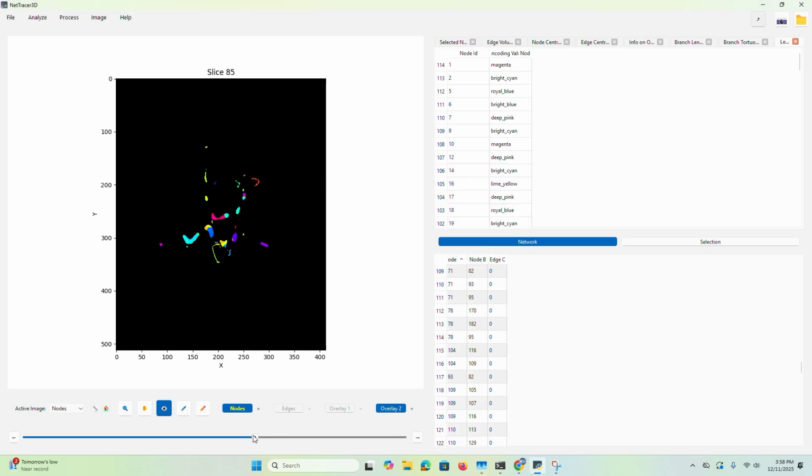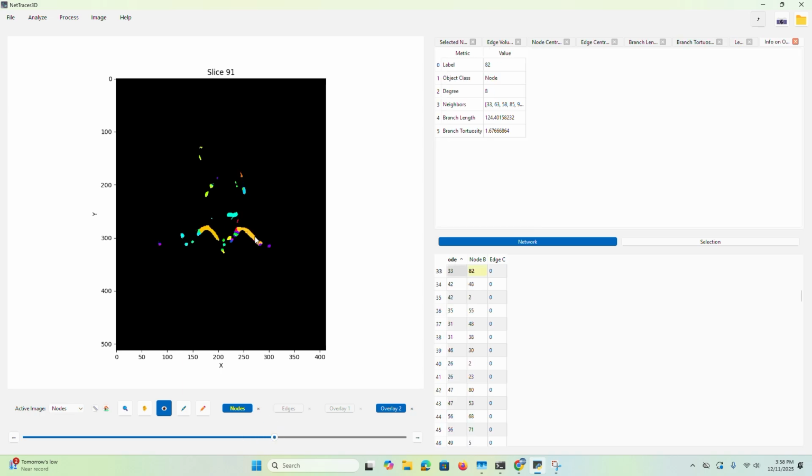And now when we look at this, you can see that these side branches are a lot less chopped up. This can be a good option, but the only disadvantage is it can be somewhat unpredictable in how it's labeling stuff, just because it's a computer making a prediction. It might not be the way that you would intuitively think of it. So I would recommend running it and seeing if you like the output. I have this disabled by default just because the default settings have a lot more predictable results. But for example, you get larger structures that way.